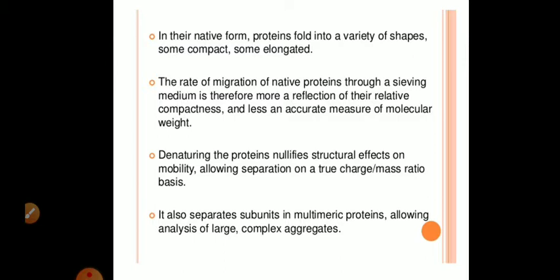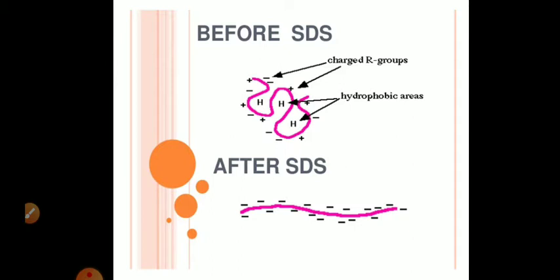So the solubilizers are urea to break hydrogen bonds, sodium dodecyl sulfate to destabilize the hydrophobic attraction and convert the protein into a negatively charged molecule, cetyl trimethyl ammonium bromide as a cationic detergent, and beta mercaptoethanol to break the disulfide bridges. But whenever we use beta mercaptoethanol, this treatment is to be followed with iodoacetate treatment to prevent reassociation of the protein threads. Now, let us study electrophoresis of proteins by sodium dodecyl sulfate.